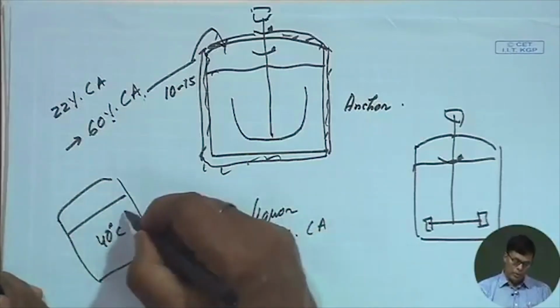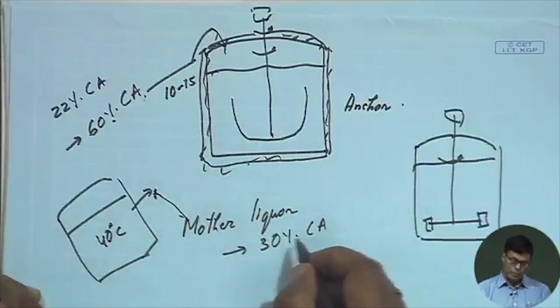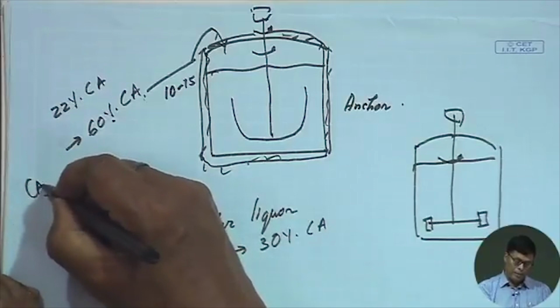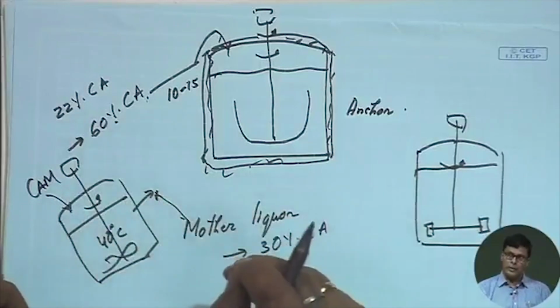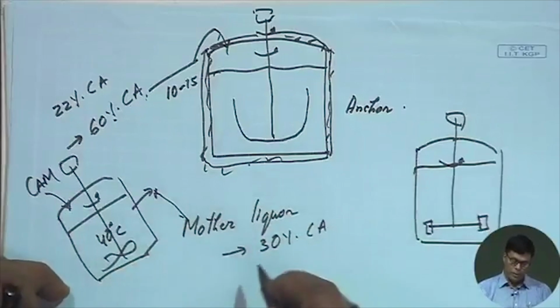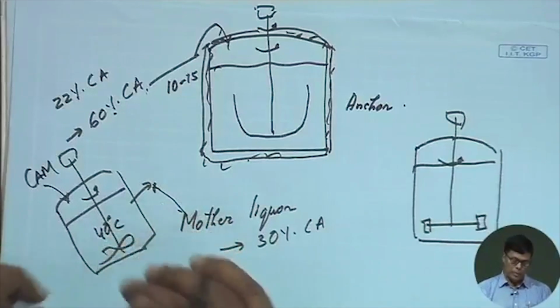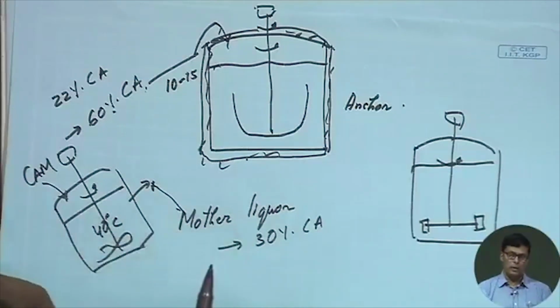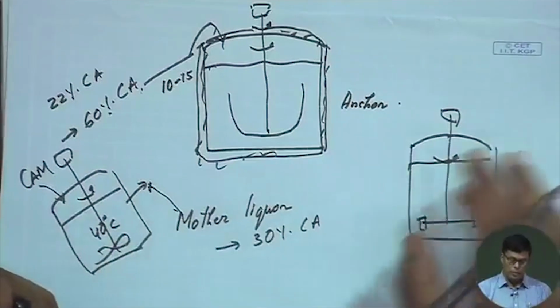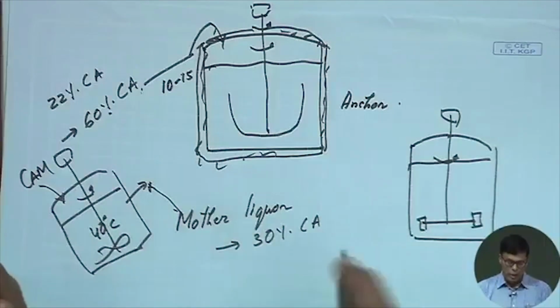We put an agitator in, and then the water present in the citric acid crystals goes into the solution. When all the water molecules present in the monohydrate go into the soluble form, we take the material out and centrifuge it, and we get citric acid anhydrous, which is largely used in the pharmaceutical industries.